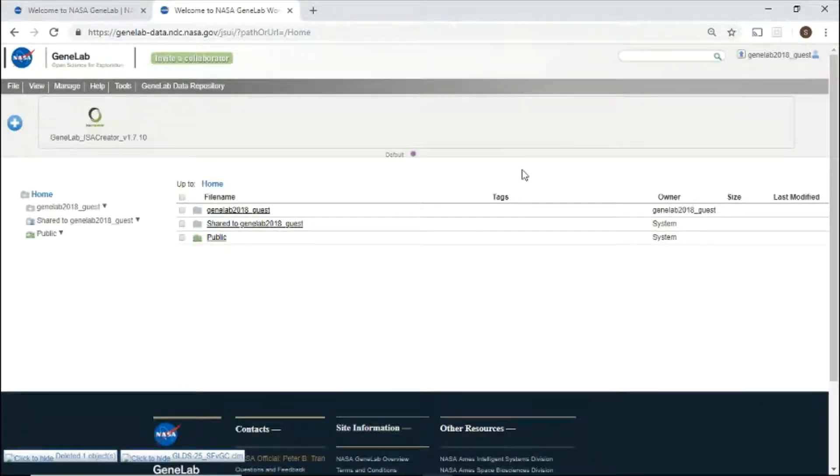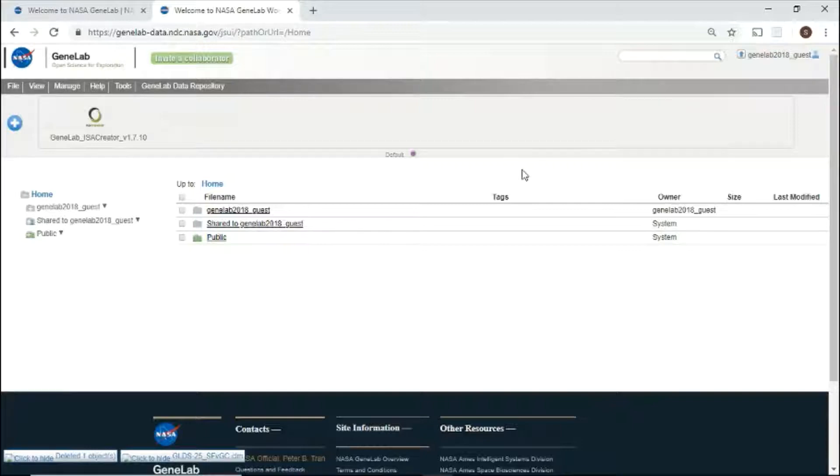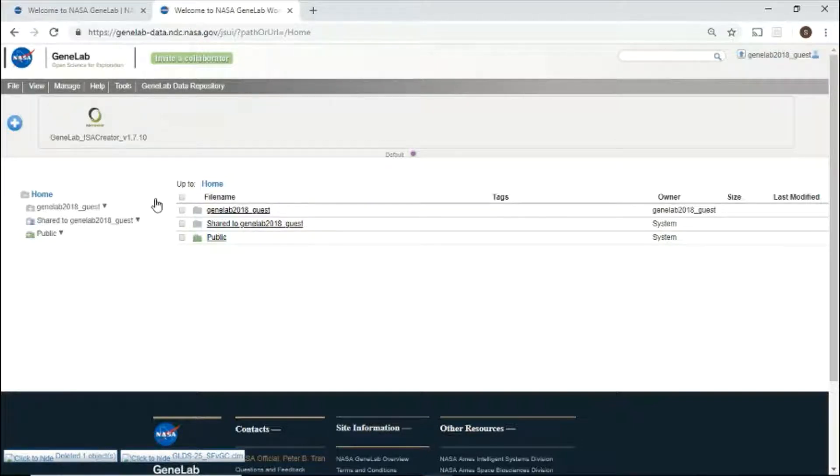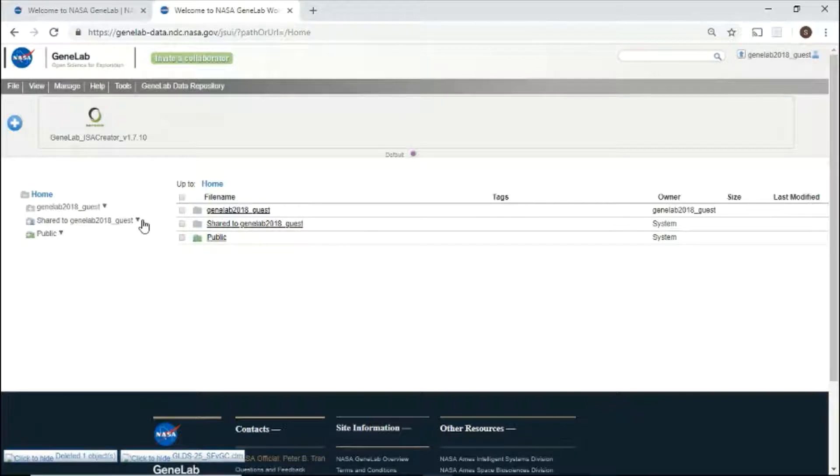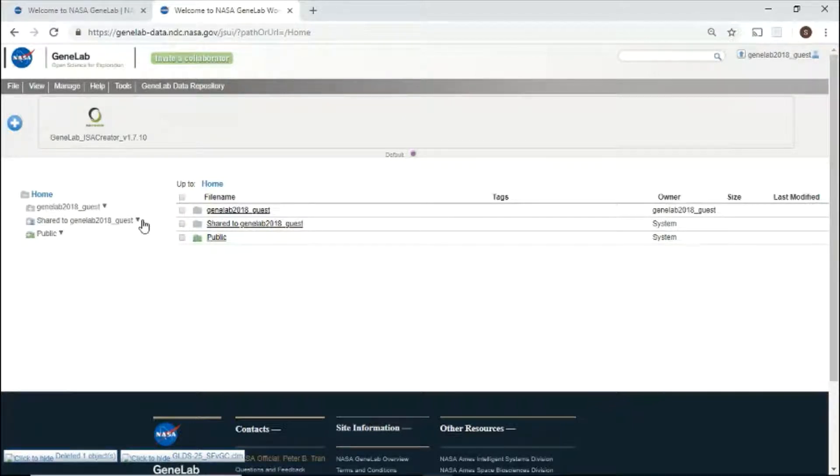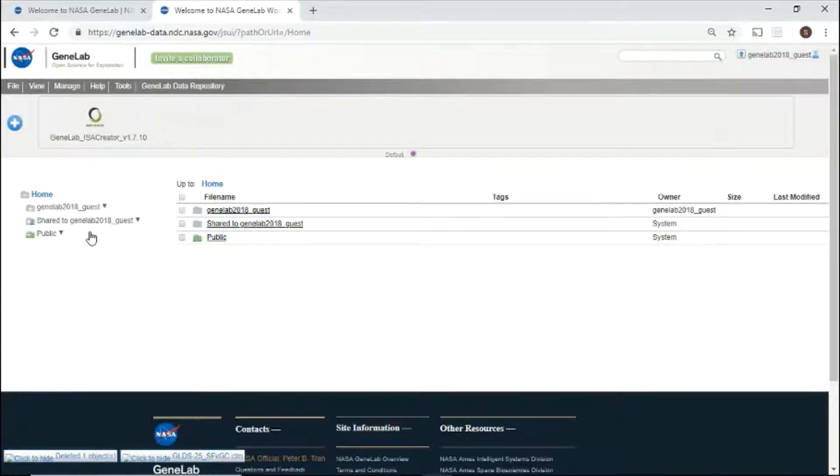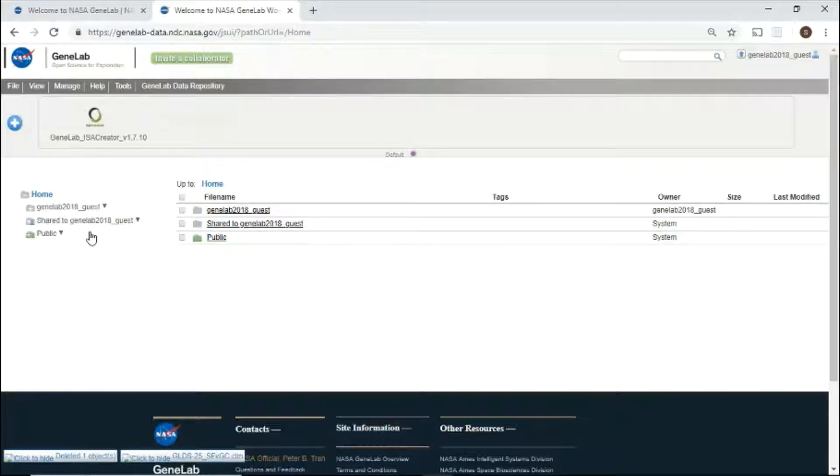The workspace provides users a platform to upload, store, and share files. The left directory panel provides an overview of all the directories and files. Your private directory is listed first, displayed as your username. Your shared directory includes folders and files shared with you by your collaborators, displayed with shared to in your username. The public directory contains all the studies in the public GeneLab repository. Let's go through each directory.